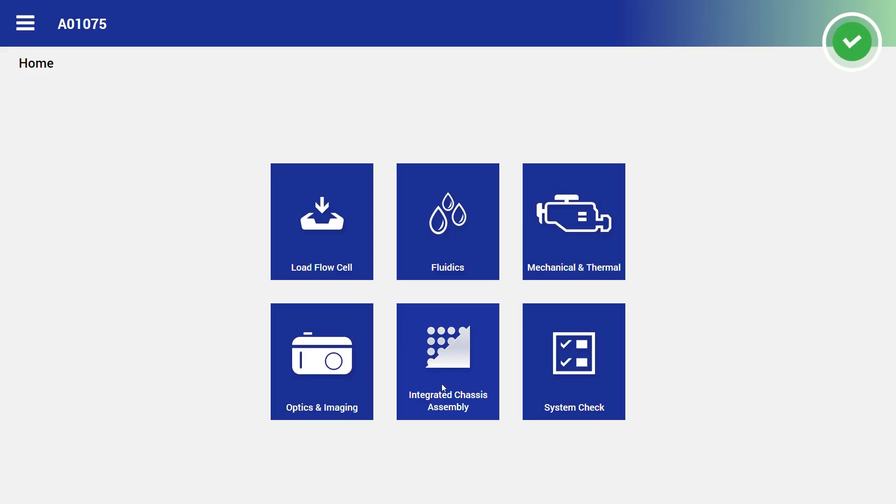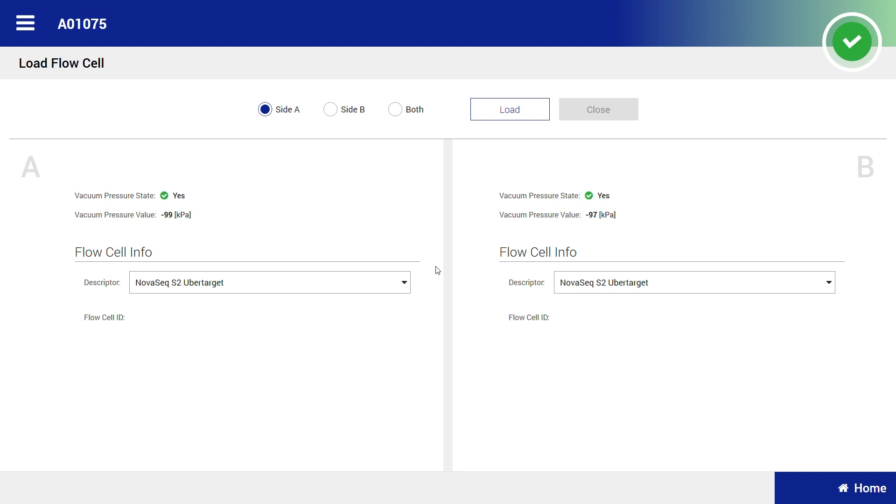To start the system check, select load flow cell from the home screen. To load two wash flow cells, select the both option and select load.